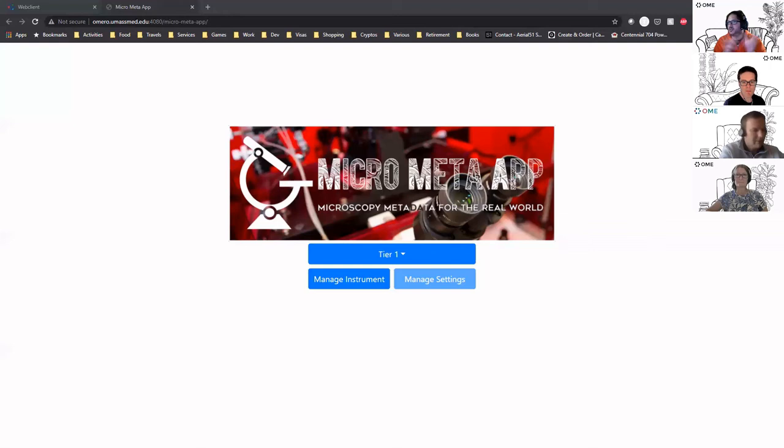I see. So it's completely modular, so that, for example, the 4DN initiative has a portal called the 4DN Portal, and they are trying to integrate this plugin right now. So they use just the core version, and they wrap it in their own way to make it interact with their own database.